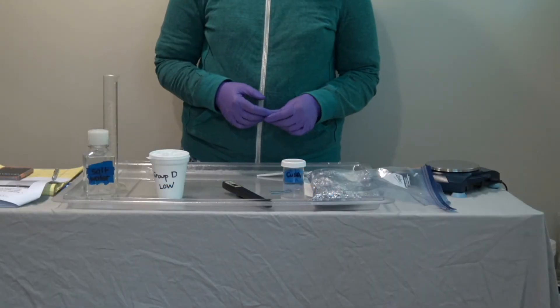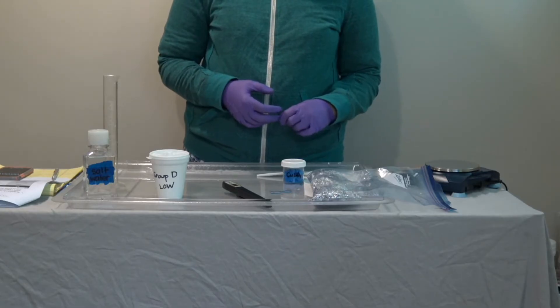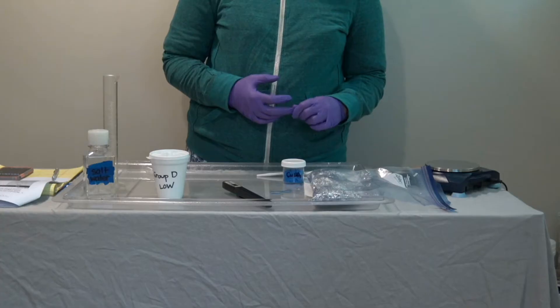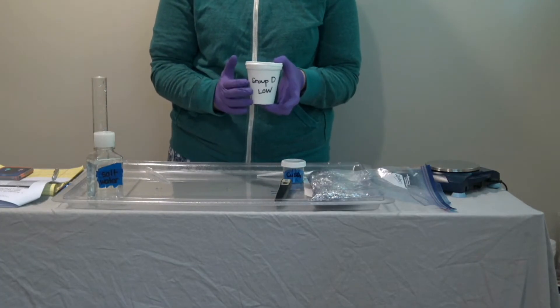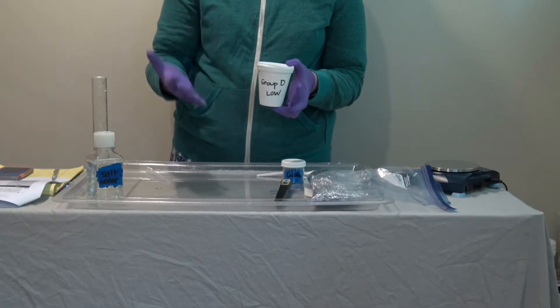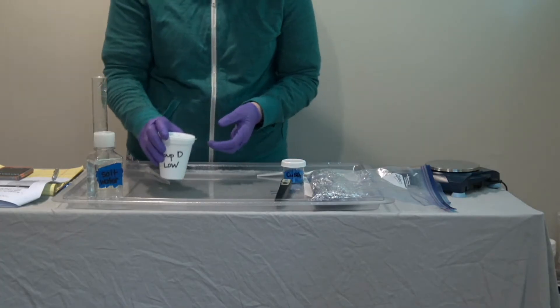In this investigation, groups D and E will be measuring the temperature increase caused by the mixing of root killer, aluminum foil, and salt water. I'm just going to do a demonstration for one — the low level of root killer and aluminum foil and salt water — but the procedure will be the same for the medium and high levels as well.